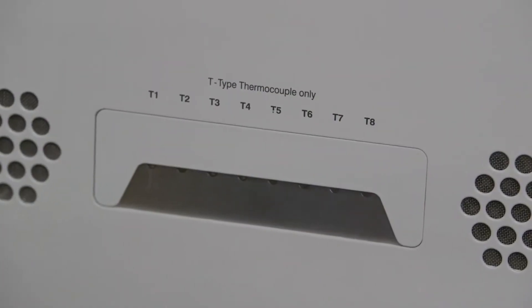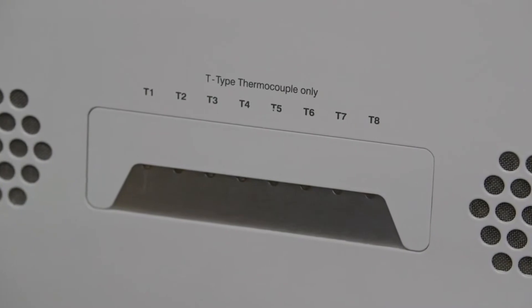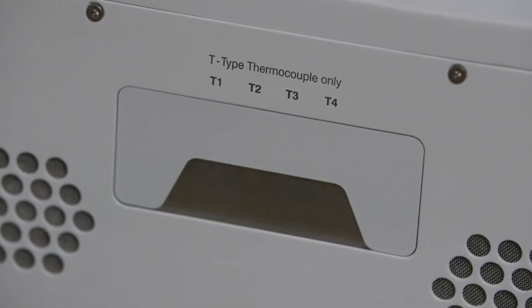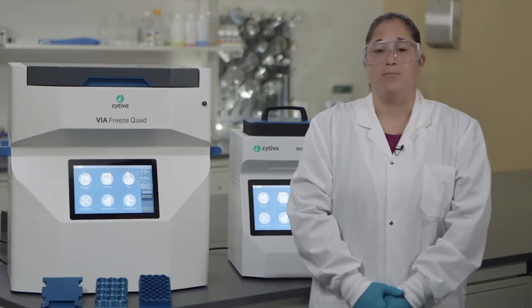On the back of the ViaFreeze Quad freezer there are eight thermocouple ports. ViaFreeze Duo each have four ports. These thermocouples can be used to capture data directly from your samples.